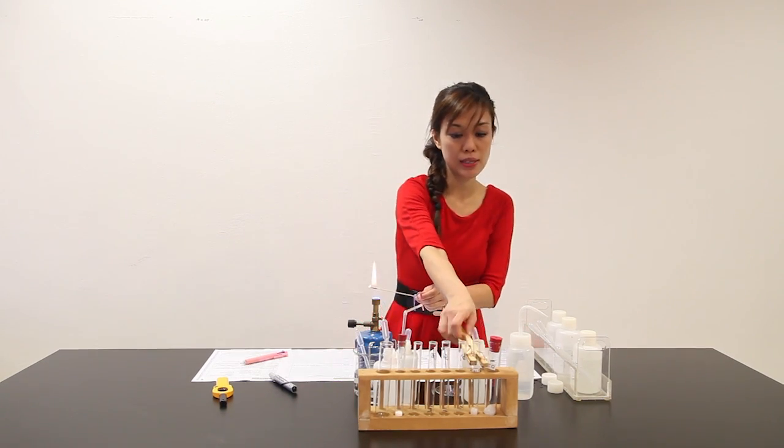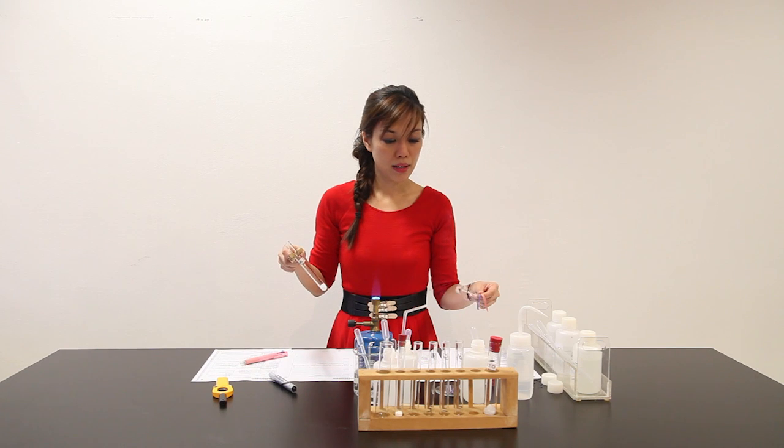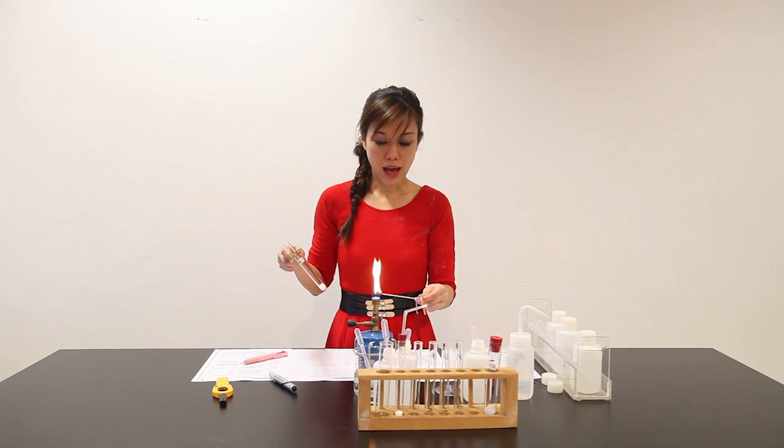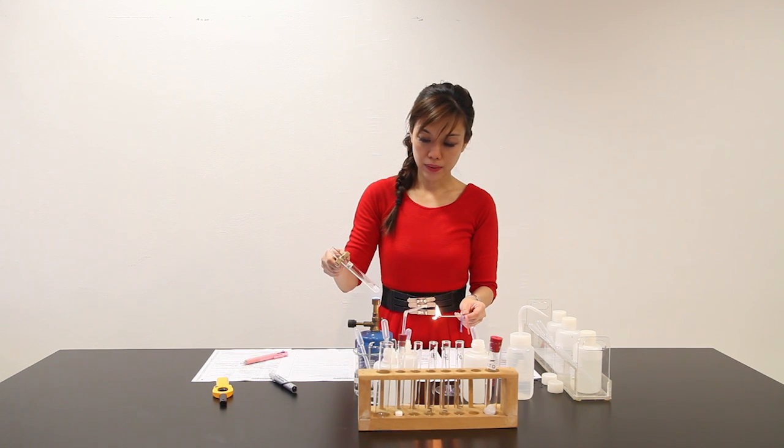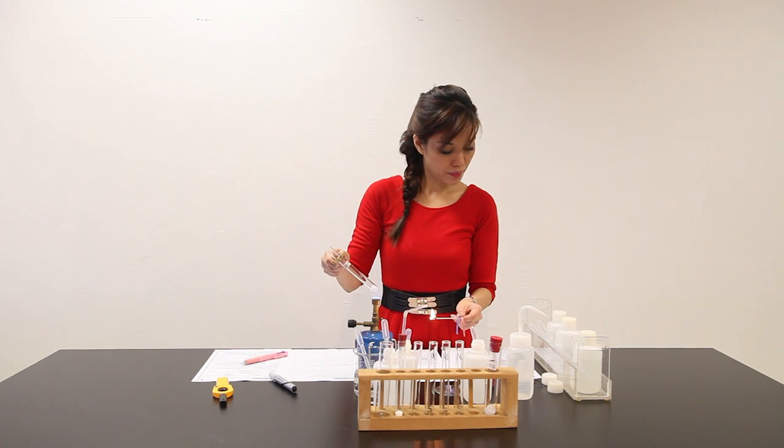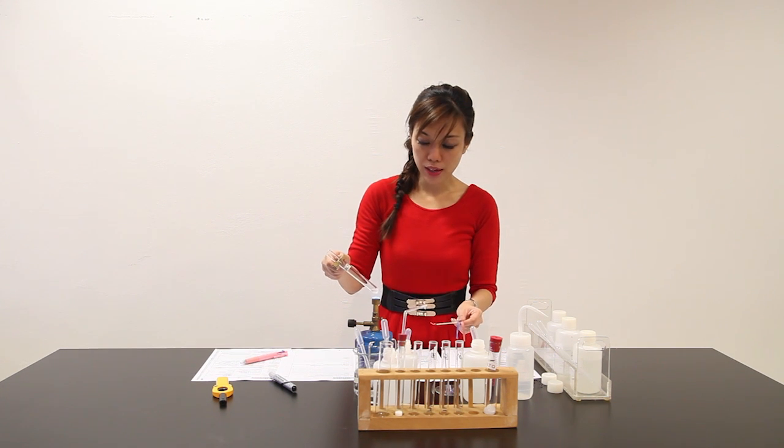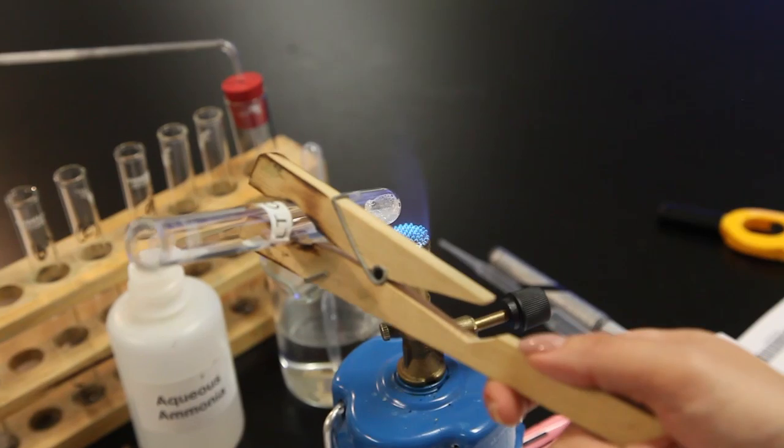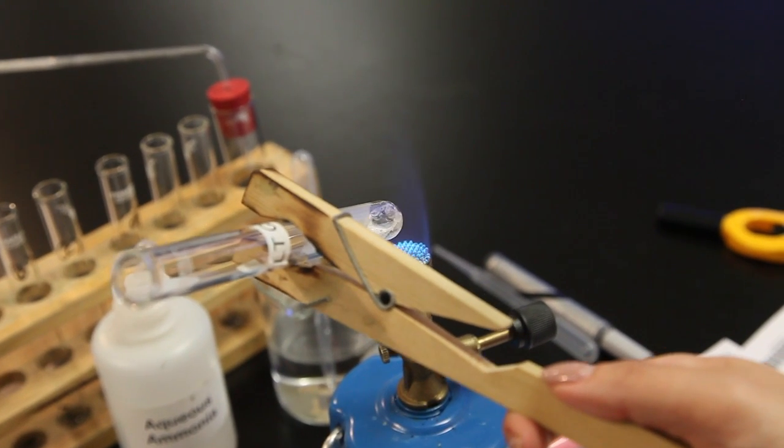Red litmus paper and blue litmus paper. Dry litmus paper have no use, so I need to damp it with distilled water. At the same time, using a glowing splint. This is a lighter splint, this is a glowing splint. I will let it light up first and let's start heating. I notice solid Q melted into a clear solution, and water droplets formed at the side of the test tube.